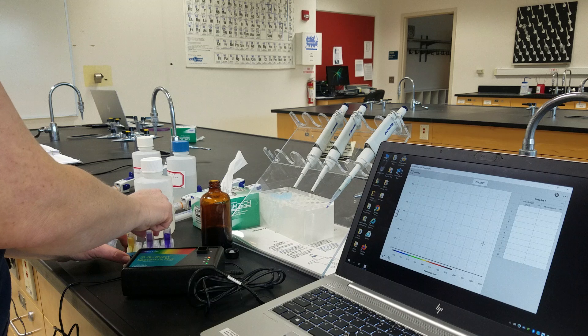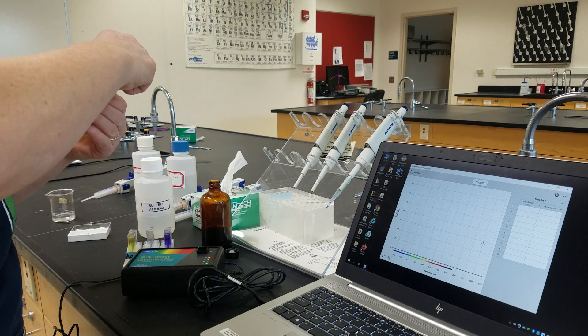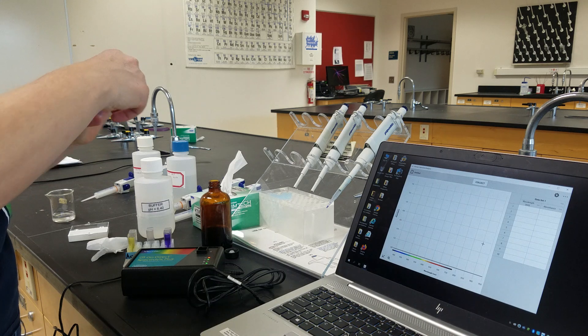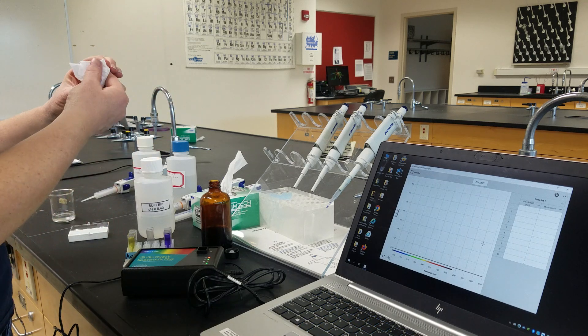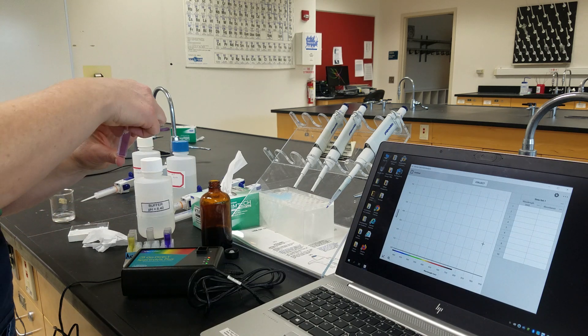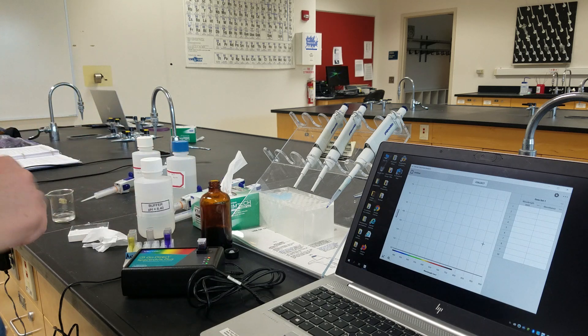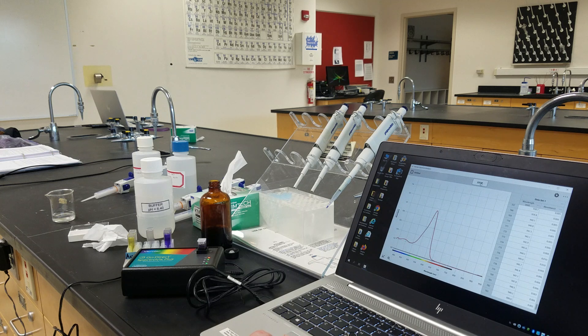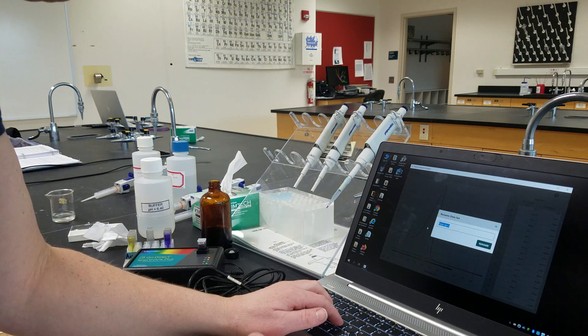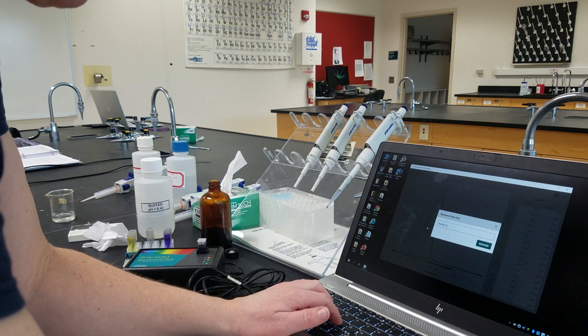We're going to start with our buffer. We want to make sure it is mixed well, so I'm going to put a cap on top and shake it up. I'll make sure the clear sides of the cuvette have no fingerprints on them and place it into the spectrophotometer. We click Collect, wait a few seconds, then hit Stop. We rename this data set Buffer 6.40.